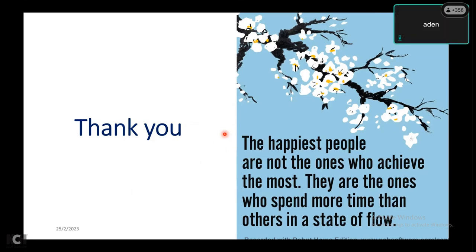In the chat box, for Dr. Avinash: do we need to run all tubes for each case, after the ALOT tube, the AML, B cell tube, and T cell tube, for each case? No, it is not necessary. If you are running an ALOT tube and you are working in a resource limited setting, you can just directly go for the positivity of your marker in the ALOT tube, because in the ALOT tube most of the people are having B or T markers, and if you are excluding that this is not a mixed phenotypic leukemia, it is a straight one lineage leukemia, you can go for that particular leukemia.